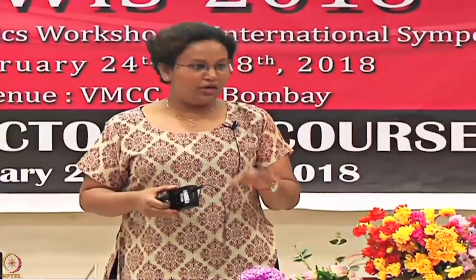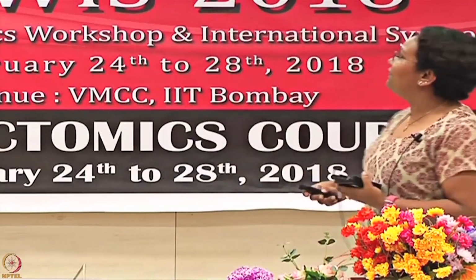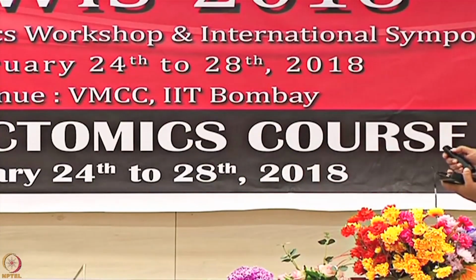Purity. The most pure one should go as a ligand, you cannot have an impure ligand. The more junk you immobilize, the data becomes more dirty. You can still use it as an analyte, so of course, again when I talk about analytes being impure, it is only limited to applications like binding experiments. If you have to do kinetics, you cannot afford to have an impure analyte, but if you are doing a concentration analysis, if you are doing a binding, it is fine to have a slightly impure analyte.